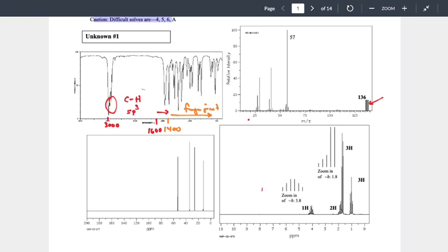And if we're looking at this diagram, we might be like, well, it looks like they're the same height. And it looks like they're the same height as an artifact of this problem. What do I mean by that? Take a look at those lines themselves. Do those lines look different than the other lines? Yeah, why? Why are they wider lines? They're not part of the spectrum.